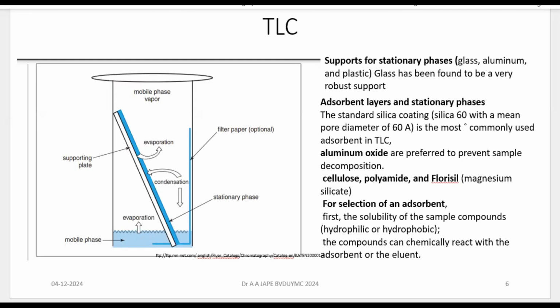If you are using an adsorbent like Kieselguhr or alumina to prepare the thin layer of the chromatographic plate, then it is adsorption principle. And if we are using silica gel that holds water, same like your cellulose paper in paper chromatography, so when thin layer chromatography is performed by using a thin layer prepared by a substance like silica gel, it works by partition principle.